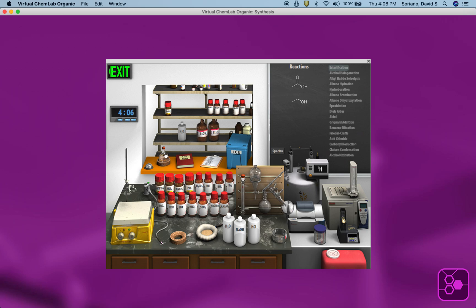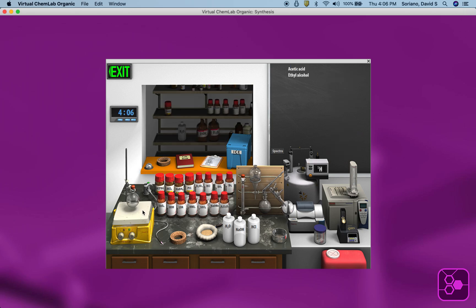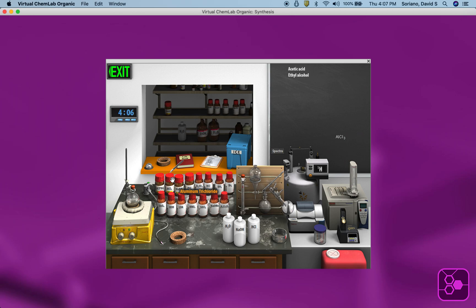I'm going to bring the round bottom now over to the stir plate. I'm going to put a heating mantle in place in a second. Let me double click. We need a catalyst — sulfuric acid. Standard Fischer's esterification: carboxylic acid, alcohol, and sulfuric acid catalyst. I'm going to double click on the sulfuric acid. It's been added.